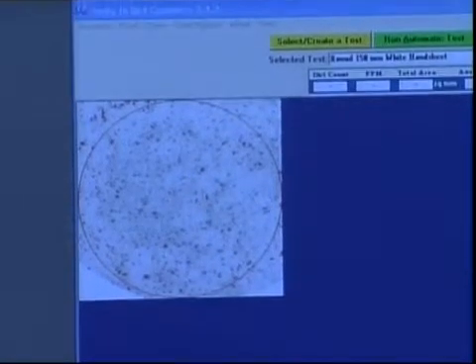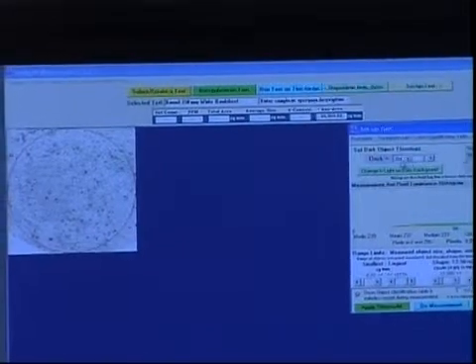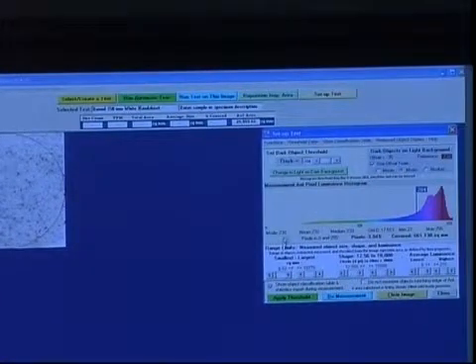So you can see here that we have a threshold set of -35, about 15% of the background as suggested by TAPPI, and that is a threshold of 204. And we measured the background. We got the statistical mode, the mean, and the median.